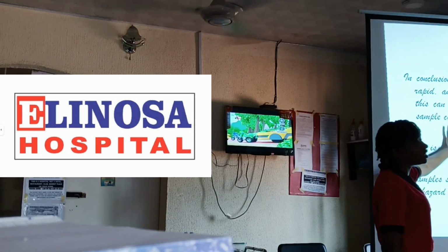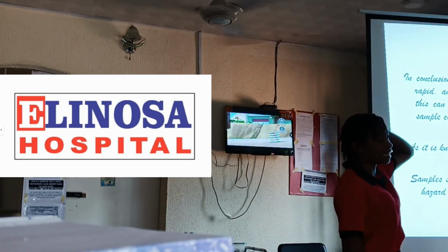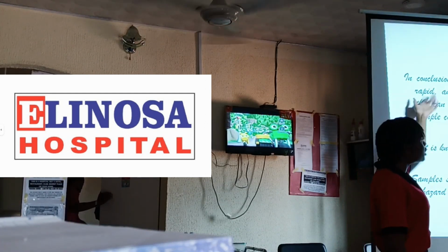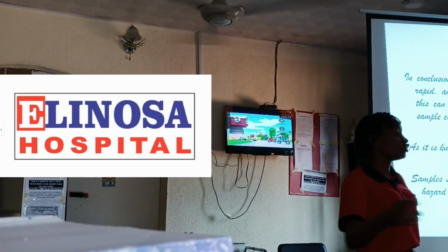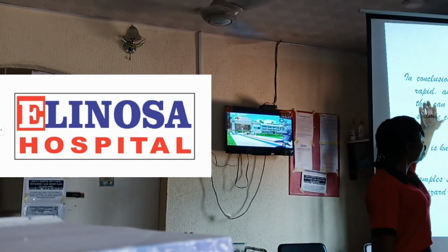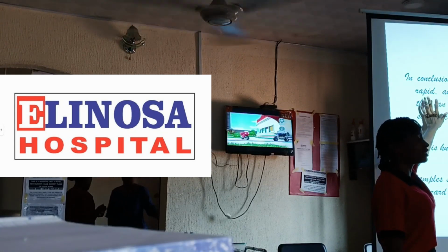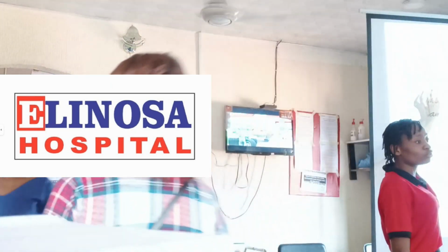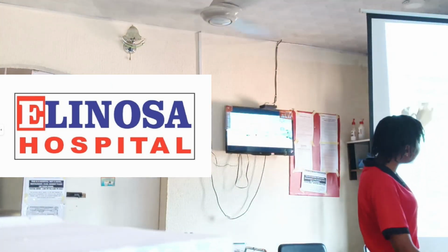Then rapid results, in the sense that you don't need to spend 2 hours running serological tests, like hepatitis B tests, using your serum or your plasma. It should be rapid, but at the right time. For example, you want to run MP, the patient starts worrying you, and you say 1 hour does not pass. On a norm, the stain normally used for MP, we stain for about 30 minutes depending on the stain and the dilution. If you dilute your Giemsa stain, the one we use to stain MP, 1 in 10 dilution, you stain for 30 minutes.